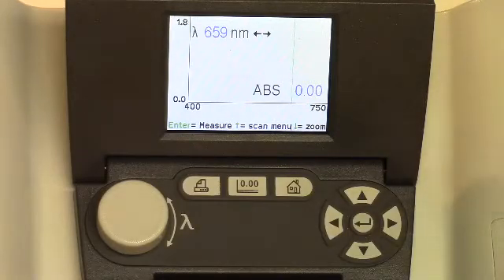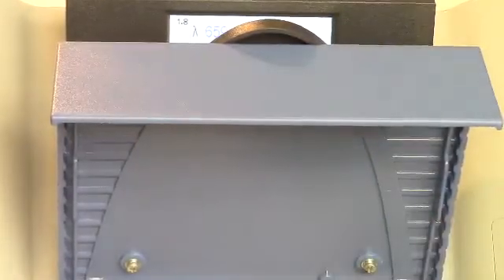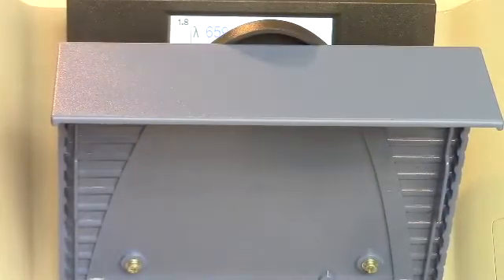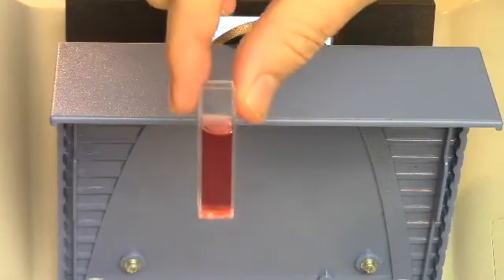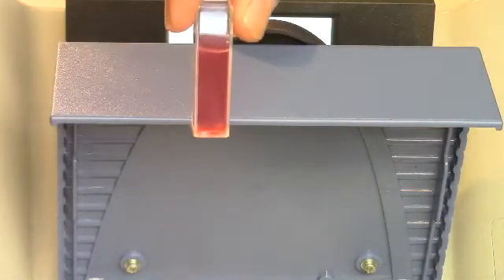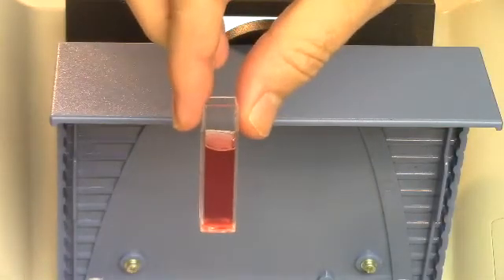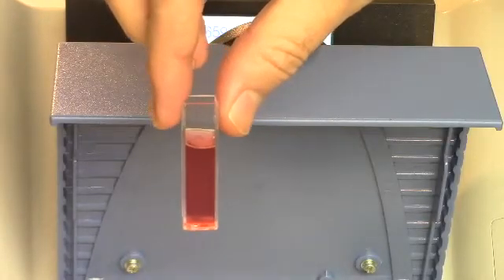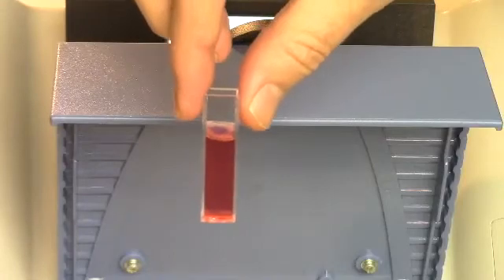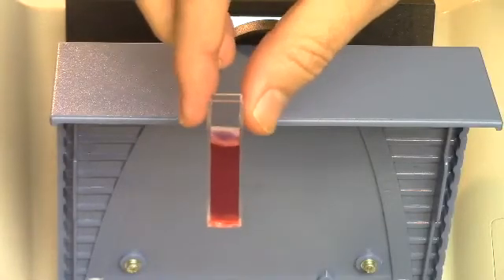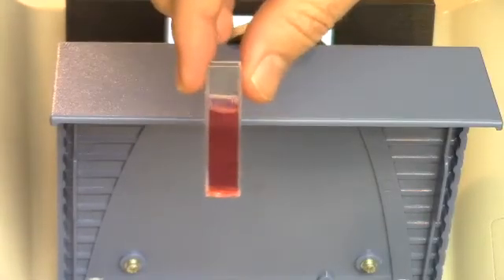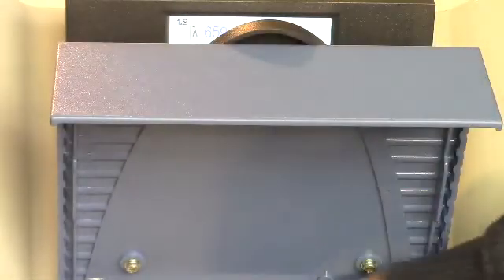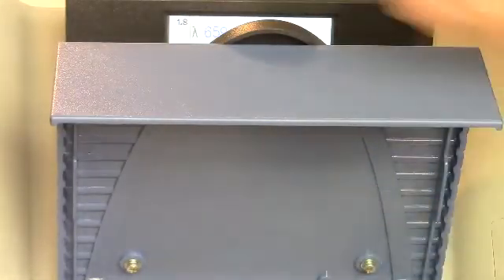So in this part, what we're doing is finding the wavelength of maximum absorbance for each of the samples. Let me take out my blank, and the first sample we're going to test is this one right here. So right there is a sample. Basically, it's just colored water. We used to use Kool-Aid, but I found that grows some stuff after a while. So we just use water with some food coloring in it, and it works very well.